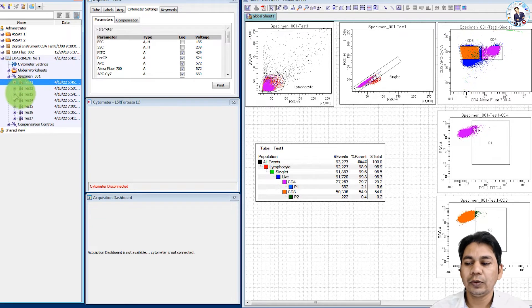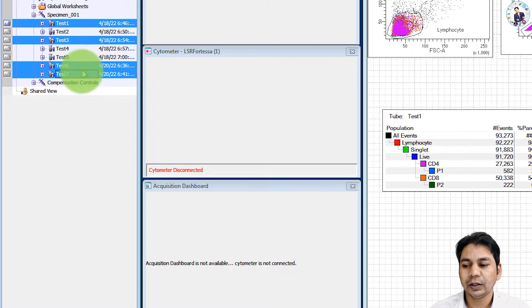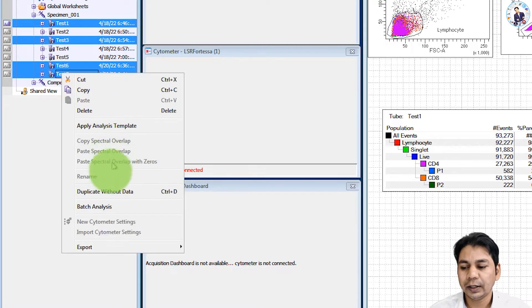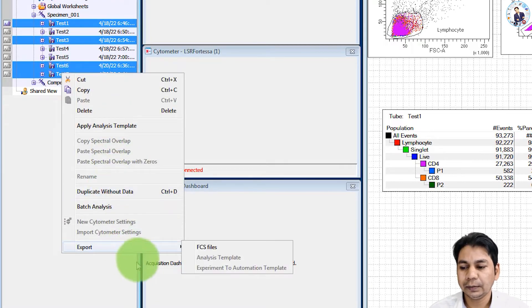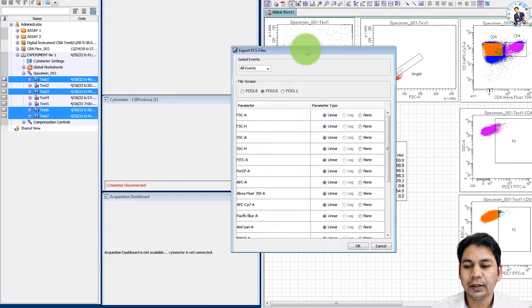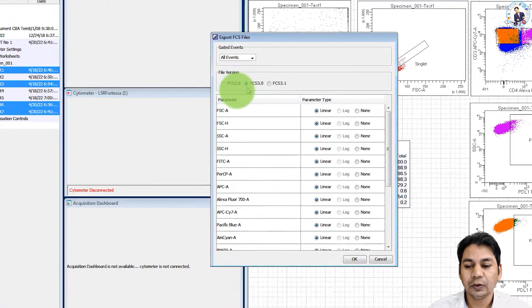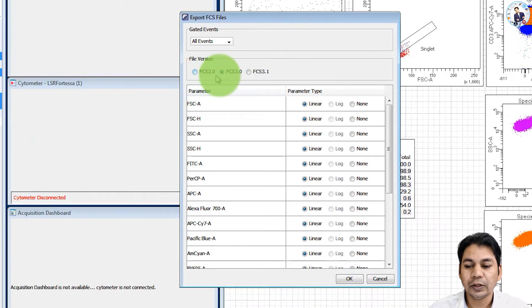To export, you can select the file that you want to export and right click, and here you can see the export FCS file option with version 2.0, 3.0, and 3.1.